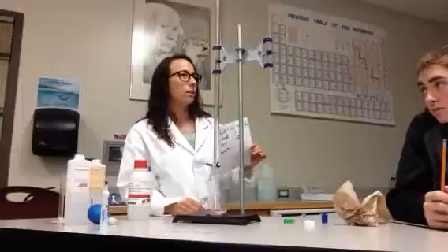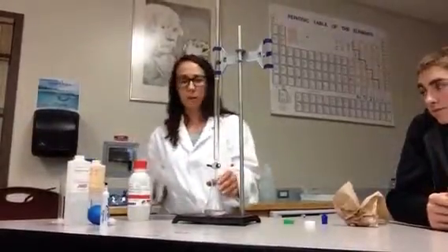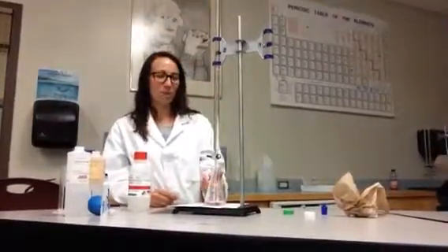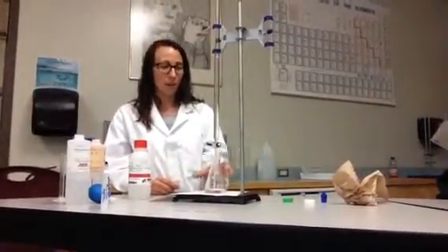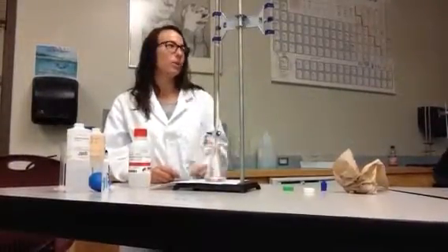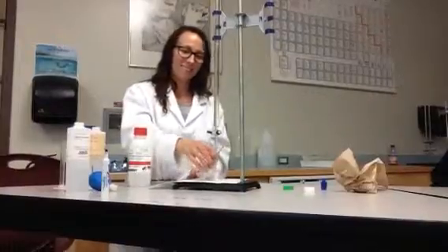Does that make sense? Who thinks I did that perfectly? I am human, after all. I know I'm good, but I am human. In fact, do you know how good I am? That's so close to being neutral or basic. If I breathe on it, your carbon dioxide dissolves in there and becomes acidic. And I bet you if I breathed into it, I could get it to become colorless again.